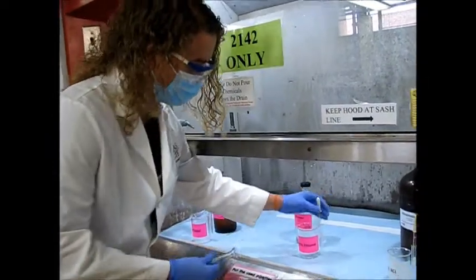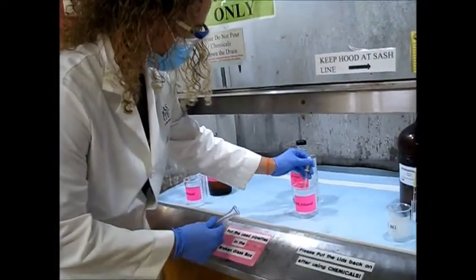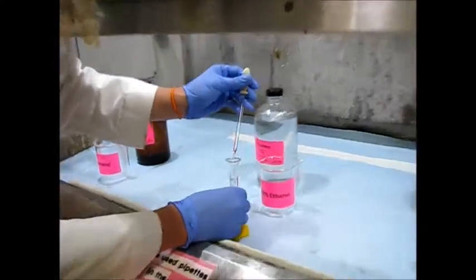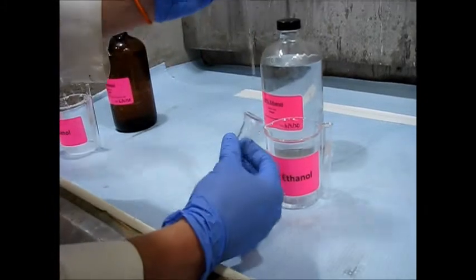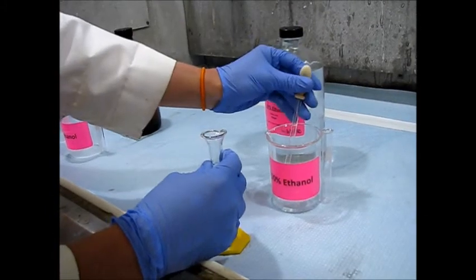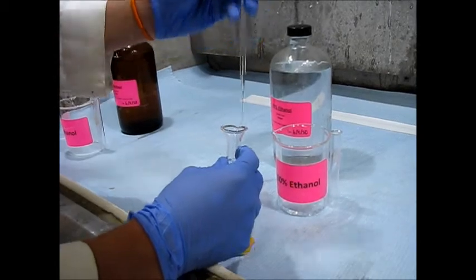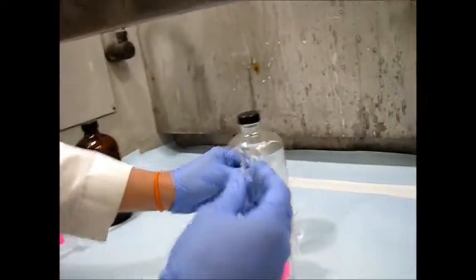So we're going to go ahead and get 2.5 milliliters of ethanol. About just right at 2 right there.